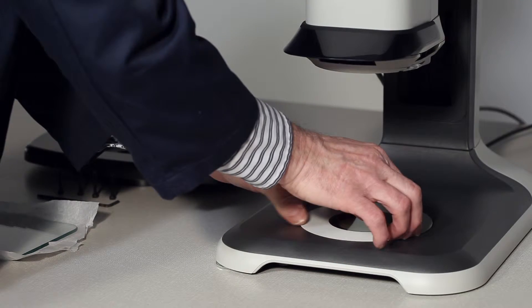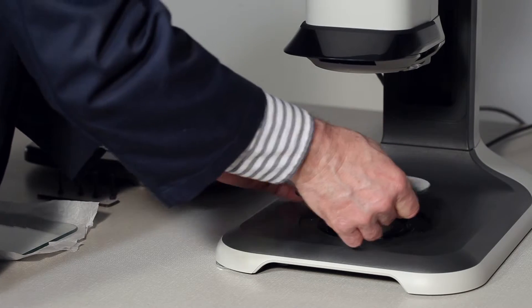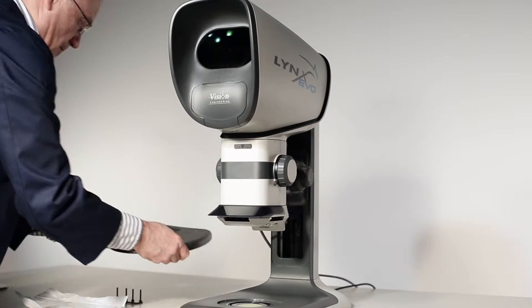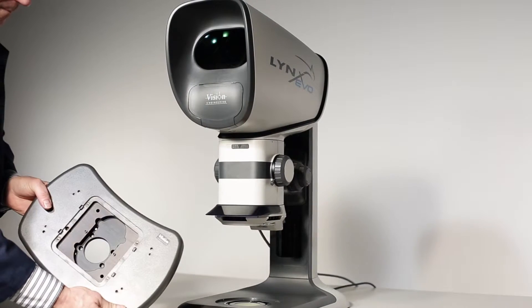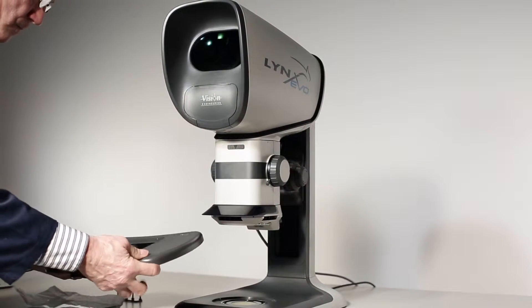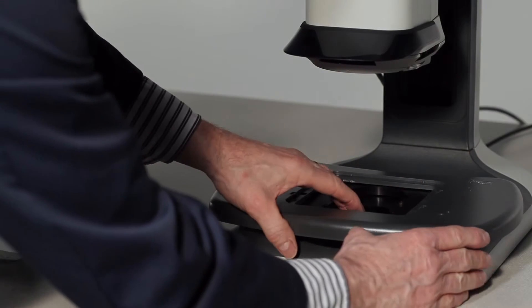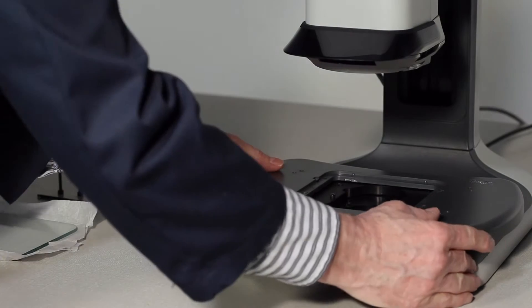How to add the floating stage to Lynx Evo Ergo Stand. Carefully remove the sample plate from the base of the Ergo Stand and position the floating stage over the mounting plate. Take care to ensure that the screw holes are positioned correctly for mounting.